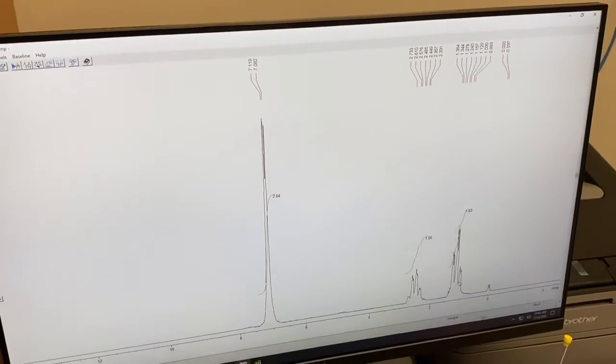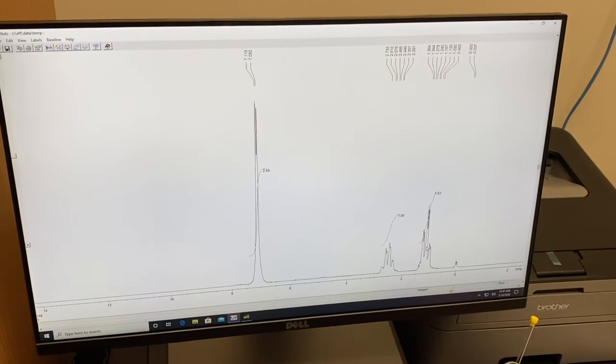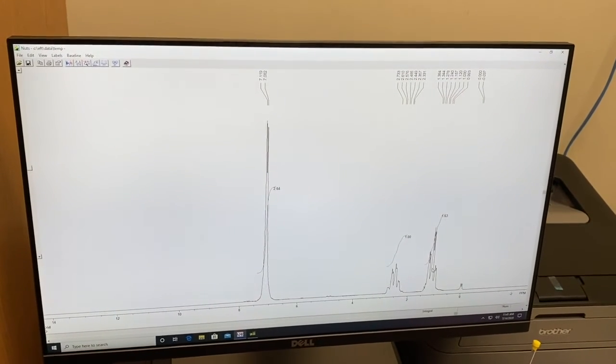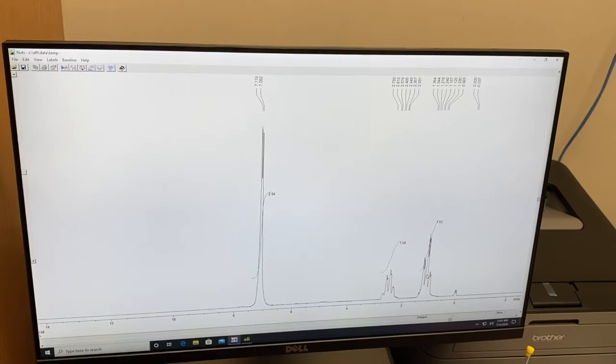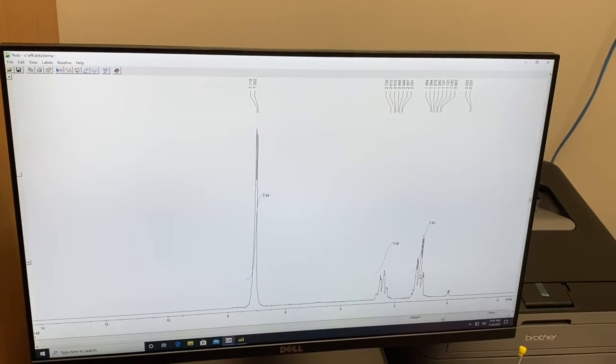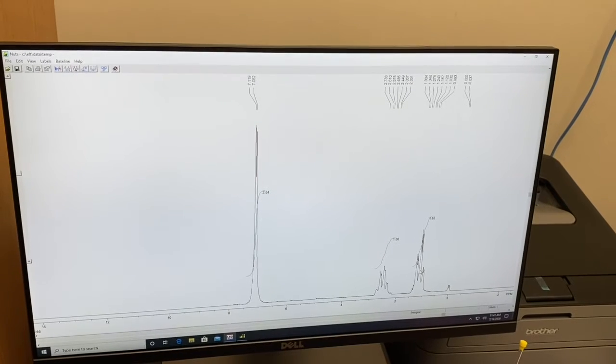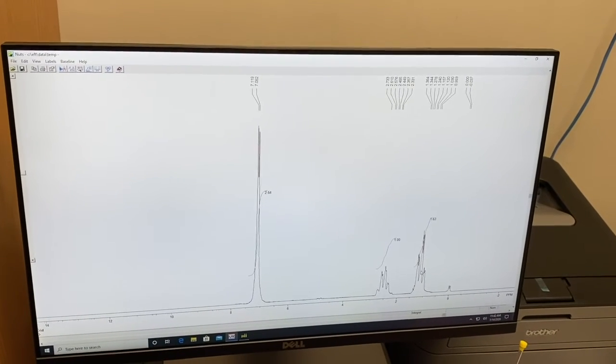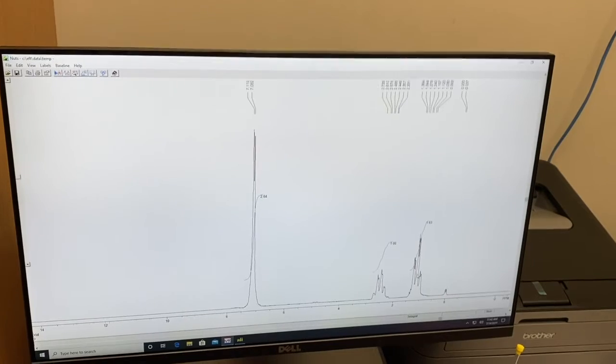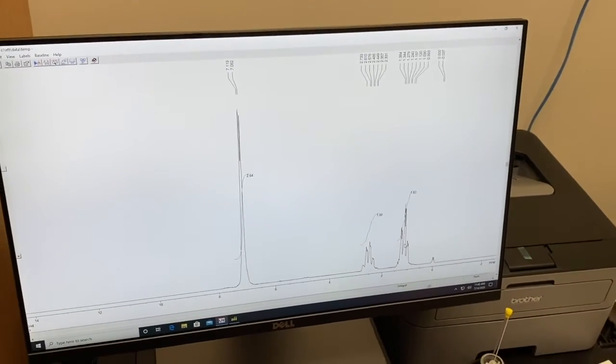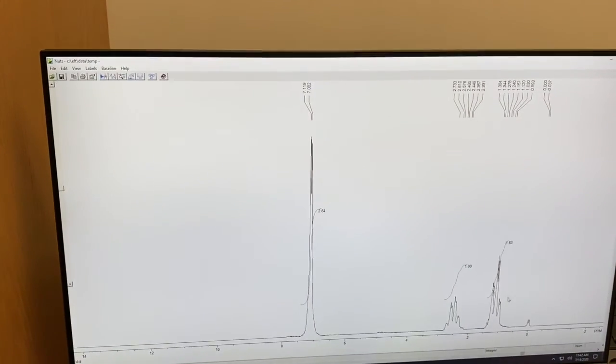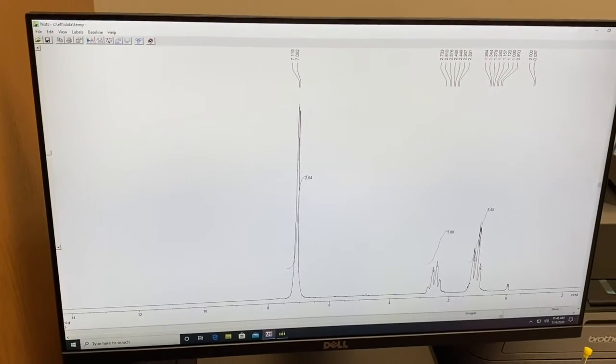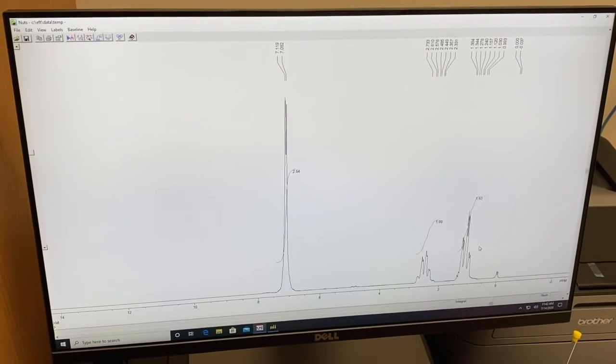So there are a few ways to approach this. You can, if you know what the sample is, actually put in a number for a known peak, and everything else should match up. If it's your unknown, pick the smallest peak, call it one, see what else the other numbers look like, and then scale up as necessary. We know what this sample is, and the triplet at about one parts per million corresponds to three hydrogens. So we're going to show you how to set the number.